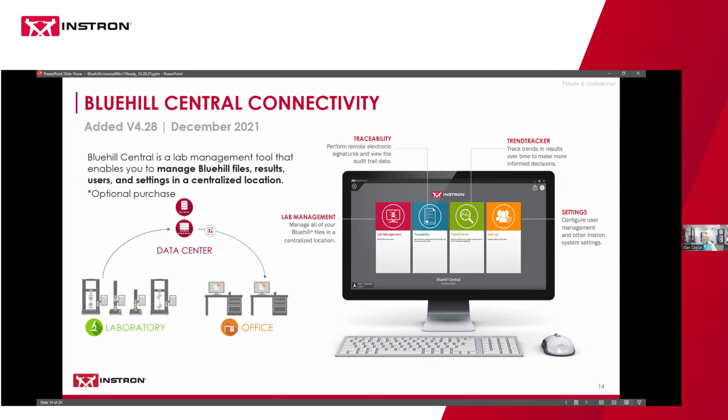And then settings, the yellow or orange role. Regardless of what you care about in the first three, you're always going to get settings. But I wanted to talk about it briefly because it's where you can, in one place, control all of your users that are interacting with your machines, and what permissions they have.